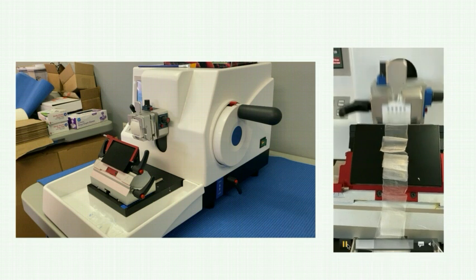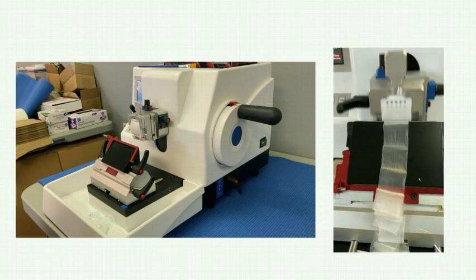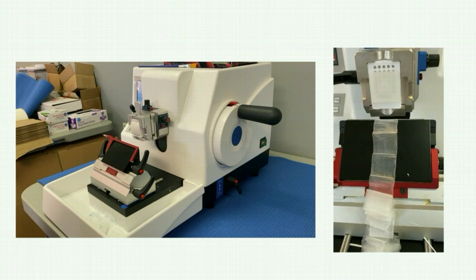The video on the right here shows how slice ribbons are made during sectioning mode. These are thinner slices, ready to be plated.